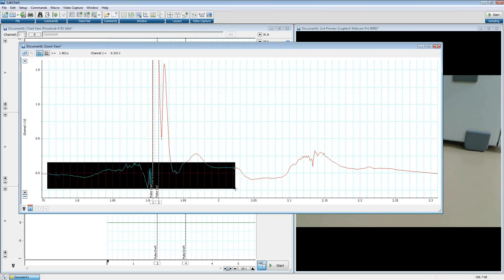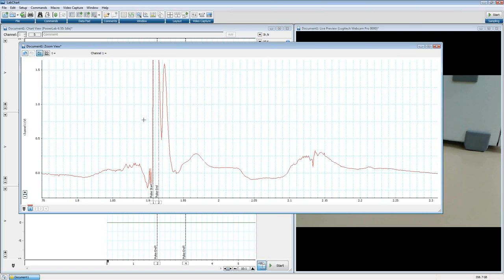Hysteresis means, say we have our threshold, let me back up there, right here at 0.5 volts. Now you can see we've gone up, and then we've come down, and we've gone below that 0.5 volt option. We may not want it to turn the fast response output off at that point. Hysteresis is a percentage value. It's a percentage of the total range that we're recording in, so a percentage of 10 volts. So if it does not go below our threshold of 0.5 volts by more than 10% of 10 volts, it's still going to keep it triggered.